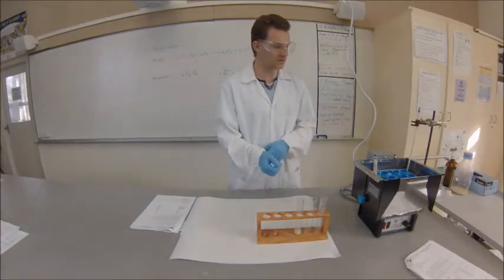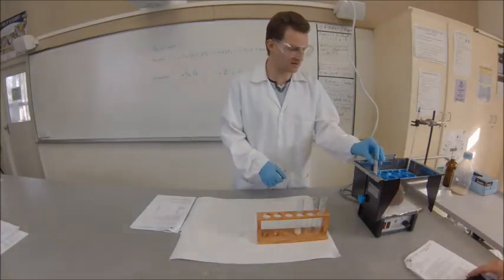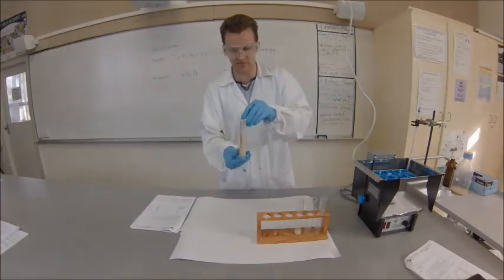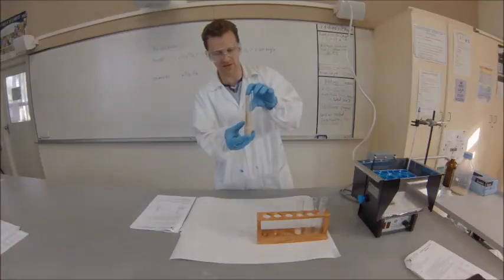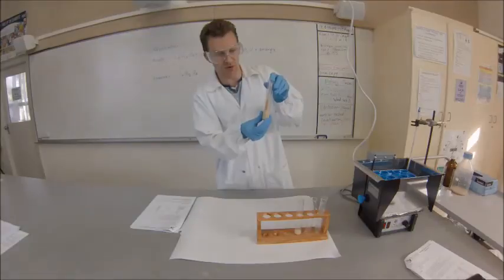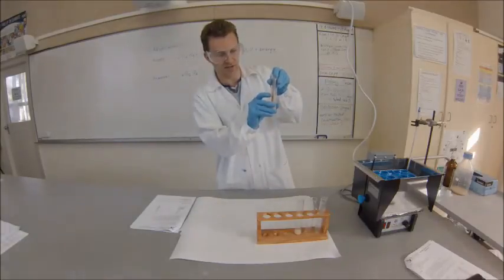We've had this sitting in the water bath for 10 minutes now. You can see the amount of gas produced is fairly substantial - it's pushed some of the liquid out of the measuring cylinder into the test tube. Now you have to measure the level of the liquid.